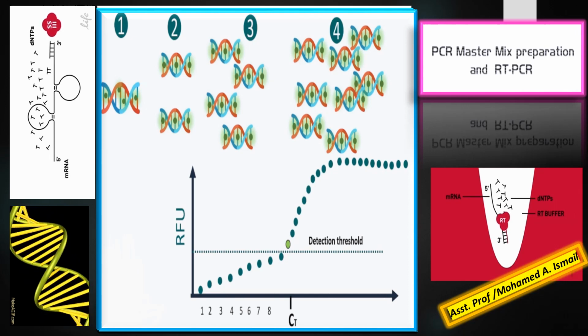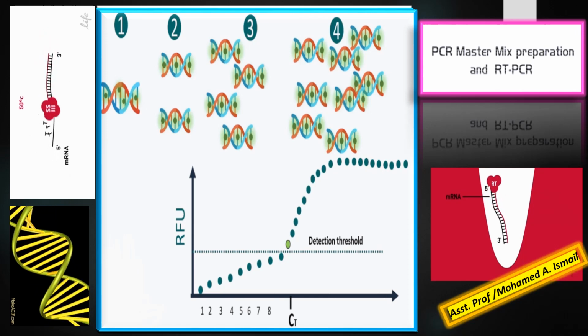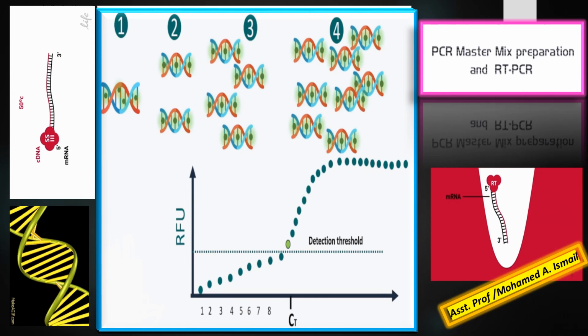CT is a relative value, as shown in this figure in front of you.